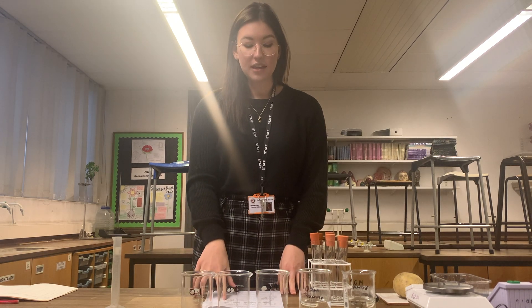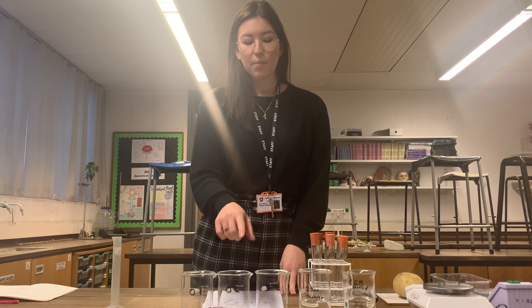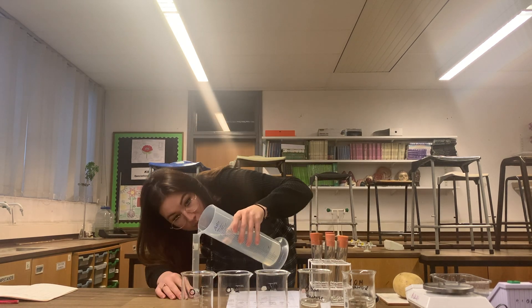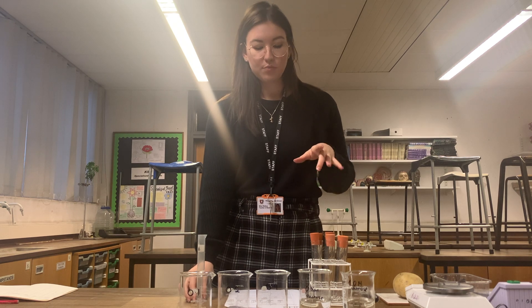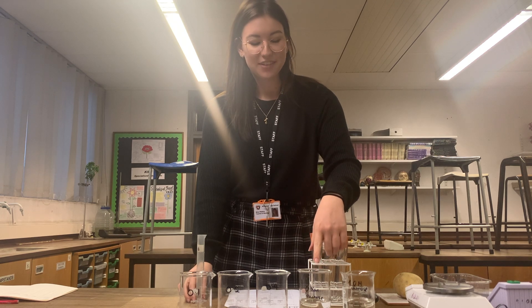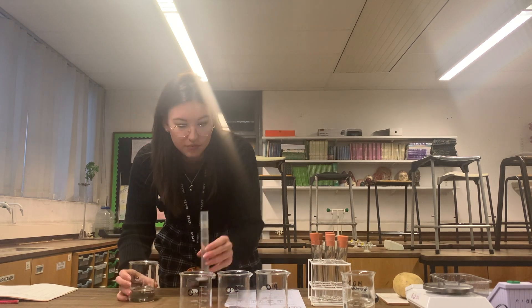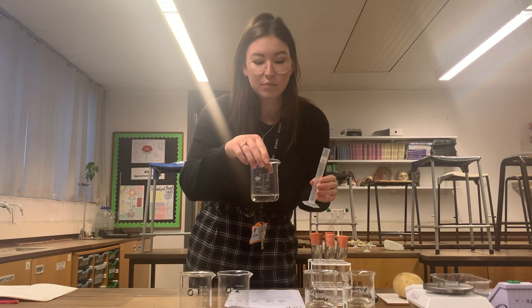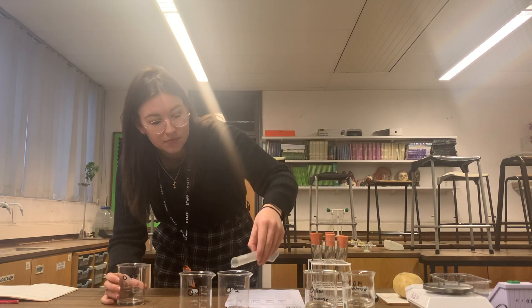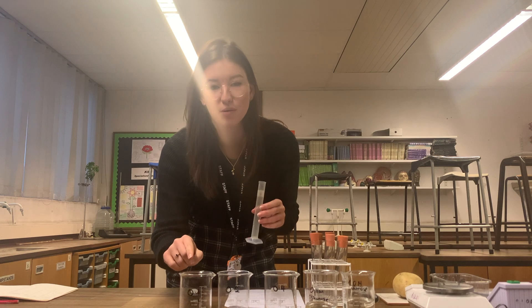The diagram suggests that in each of these three beakers, we should start off with 20 centimetres cubed of distilled water, so I'll pop that in first. Next I'm going to pour 20 centimetres cubed of our 0.8 mole per decimetre cubed sucrose solution into our 0.4 beaker. Now I'll pour 20 centimetres cubed of the 0.4 into our 0.2 beaker, and finally 20 centimetres cubed of our 0.2 solution into our 0.1 beaker.